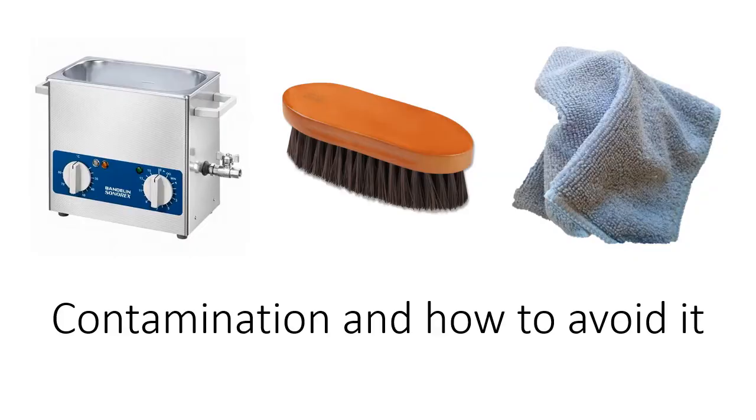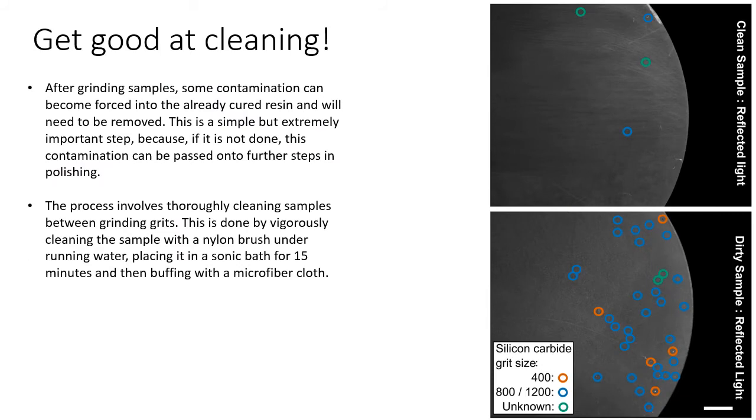We're now going to talk about contamination and how to avoid it. The easiest way to avoid contamination is to get good at cleaning. You very thoroughly need to clean your samples between each grinding and polishing stage to make sure that contamination doesn't travel through. As you can see here between the lower image and the top image, contamination can very easily move through the grits if not cleaned properly.